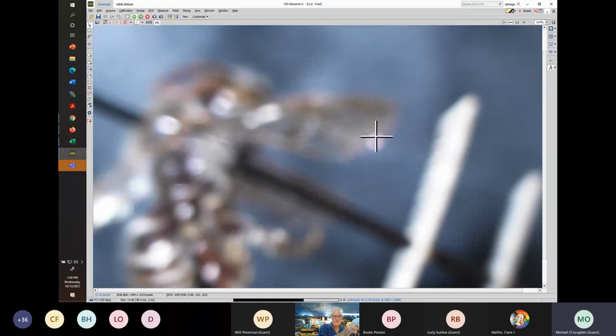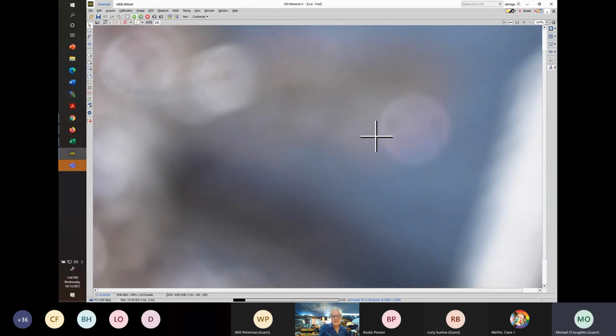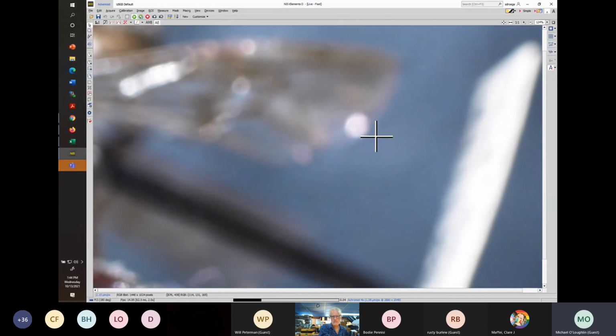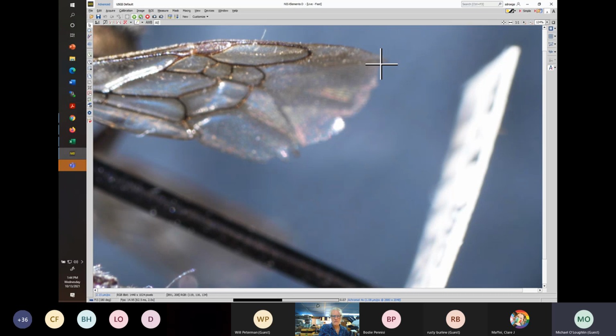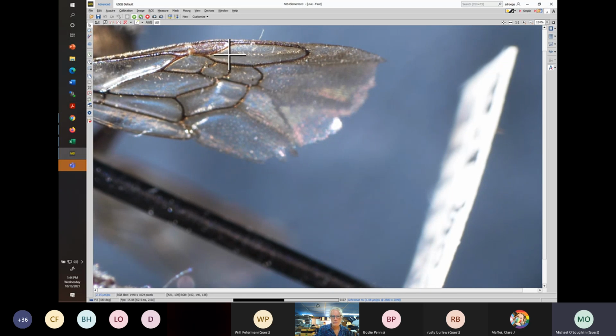we have the wing here, and the length of the marginal cell here, and here's the tip. Into focus, the length of the marginal cell, I'm presuming it's from its basalmost point, along the margin edge, but that this is longer than this distance from the apex here to the apex there of the wing.